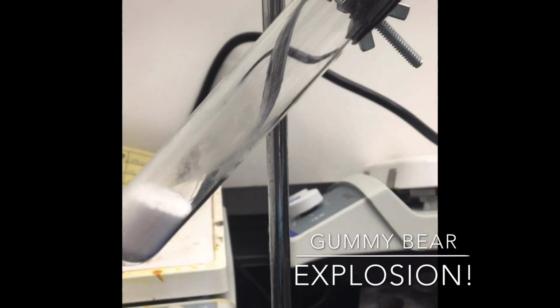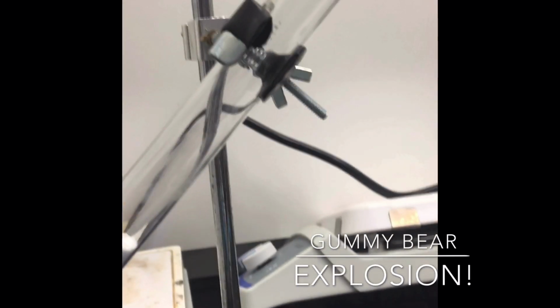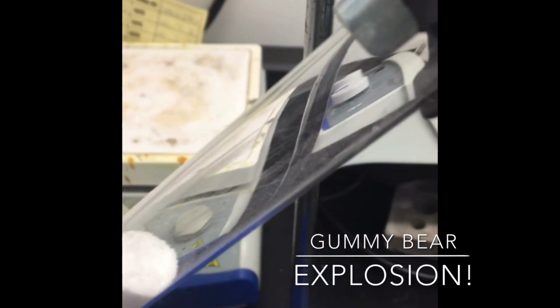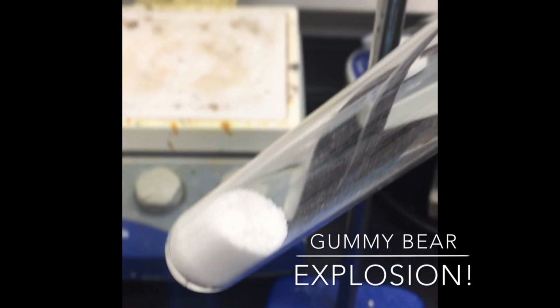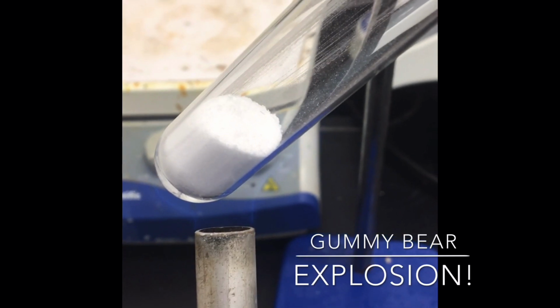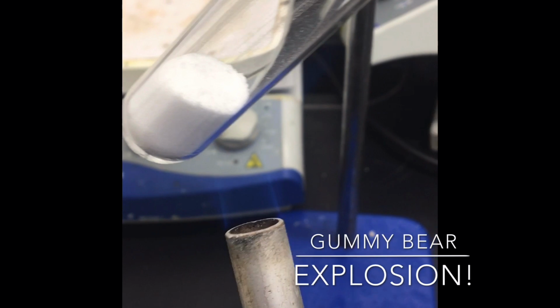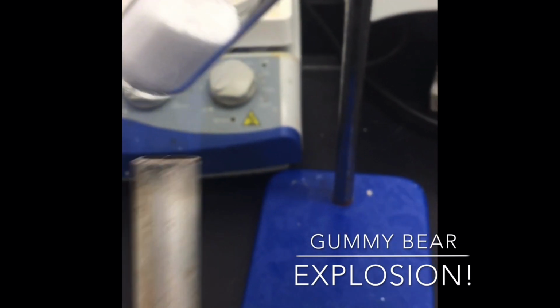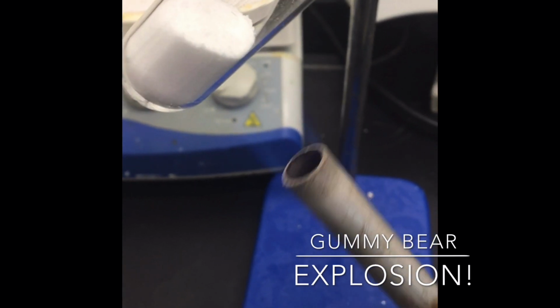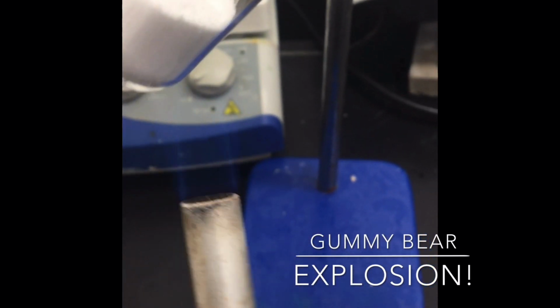And the first thing that I'm gonna do is try to melt it. So I have a flame right here, and let me actually put my hood in here. I'm gonna try to melt it as best as we can. Once we melt it, you're gonna see that it's going to turn into a liquid. That's the process of melting, adding heat. So I'm adding energy to melt this potassium chlorate.